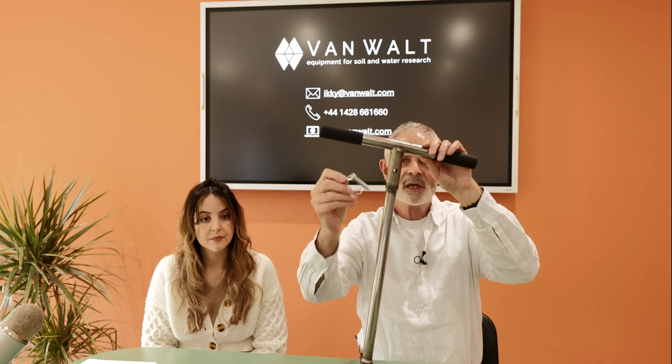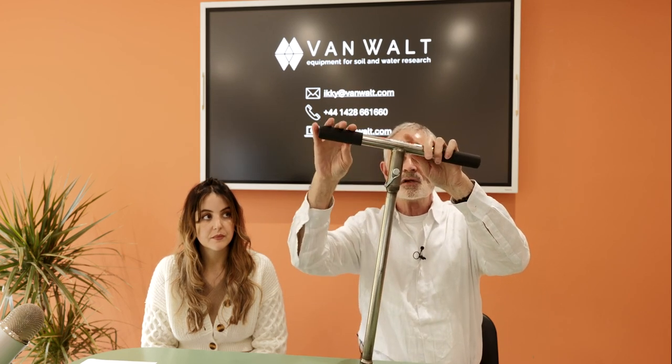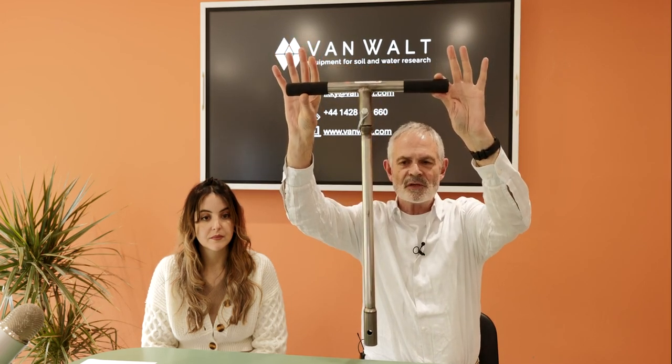You make the two pieces, and then there is a clip which goes into the device and locks into place, and now the item is ready for use. So that is the connection that we use. There are many, many connections in this world.